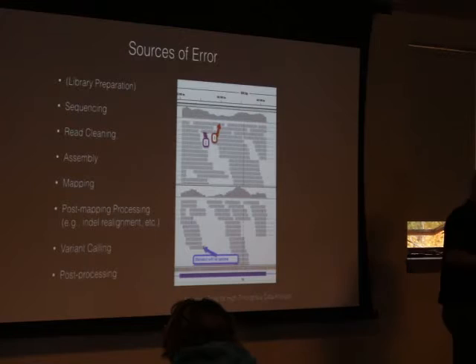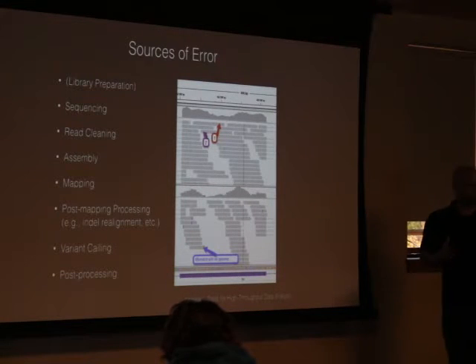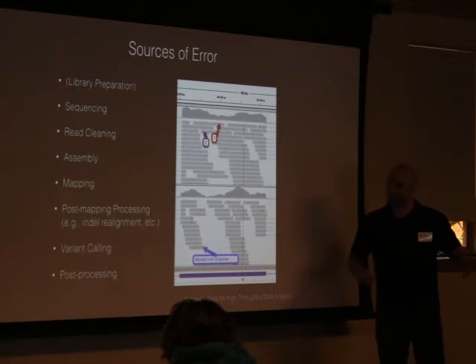So say, for example, you're amplifying out the set of targets, you might have a variant or substitution that's introduced, an error, by a polymerase. And if that error persists and is amplified up a bunch, it's going to persist throughout your library. So hopefully you have enough fragments in there that that's not necessarily a big issue.